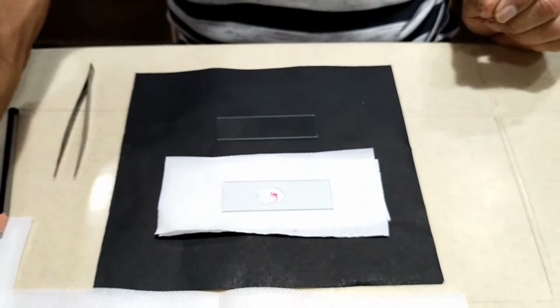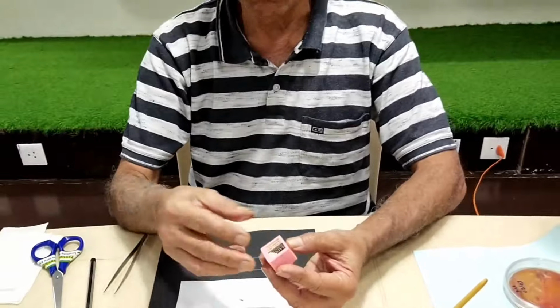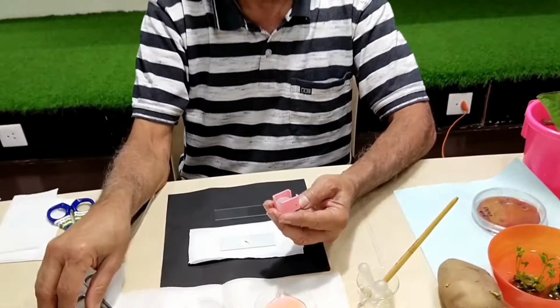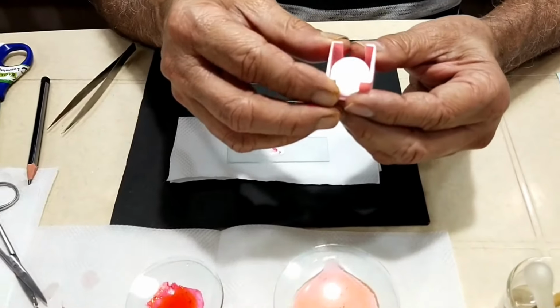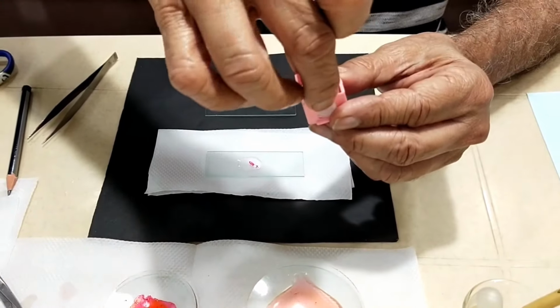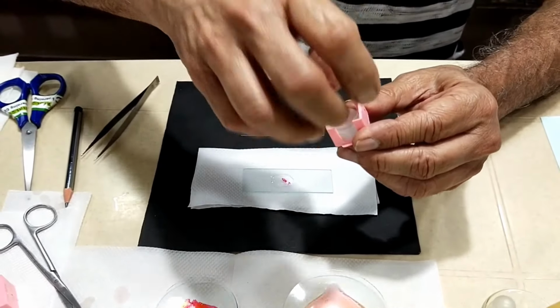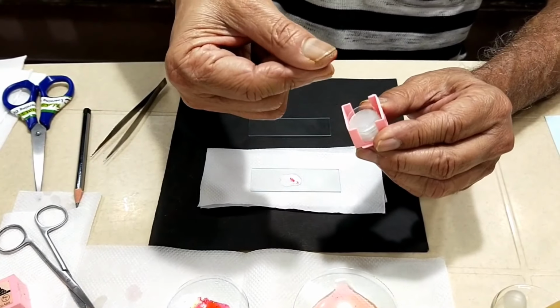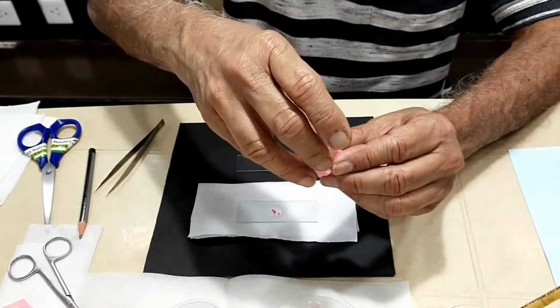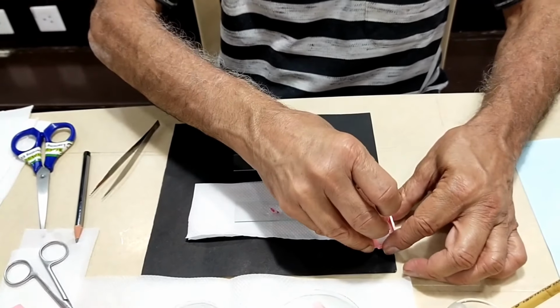Sure. This is a box which contains cover glass. Most of you know, but some of you are probably looking at these things for the first time. Can you see? They're very thin, very delicate, and you have to hold them by their sides. Why? Because if you hold them from their surfaces, then your fingerprints will appear on them. So it is good to hold the cover glass by its sides.